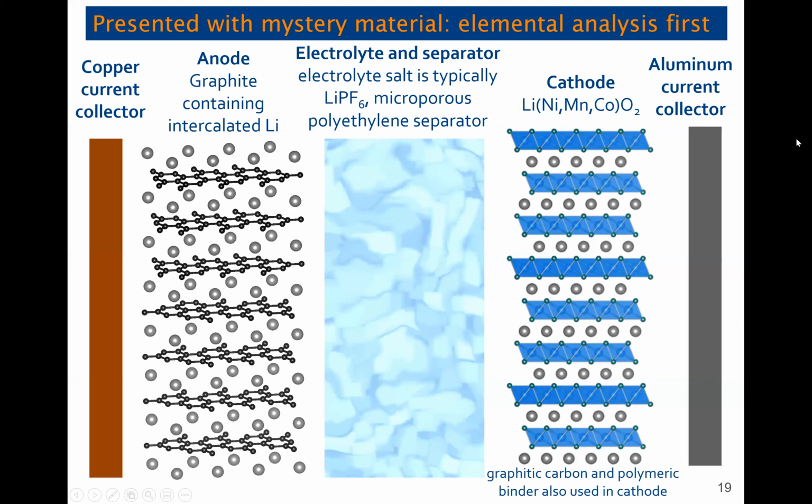but now we have to figure out what did all these things become as we chopped up the battery and maybe heated it up, maybe blasted it with acid. Who knows what they did? So we started with elemental analysis to figure out relative amounts of these things. So we found a lot of things we expected, but also some mystery ones.